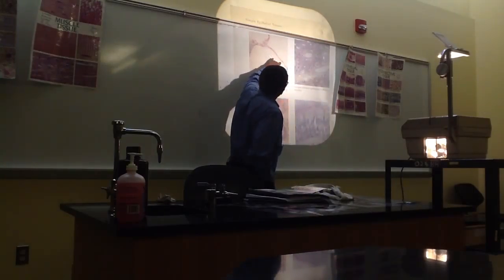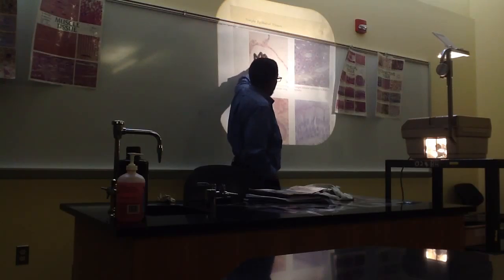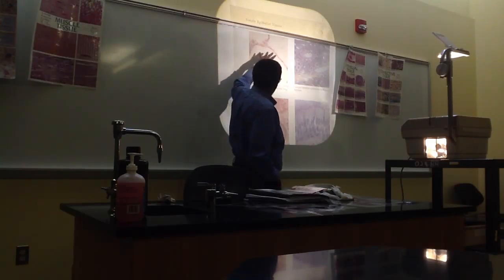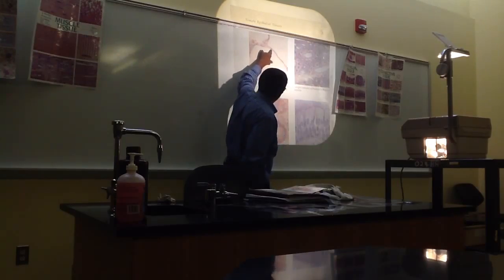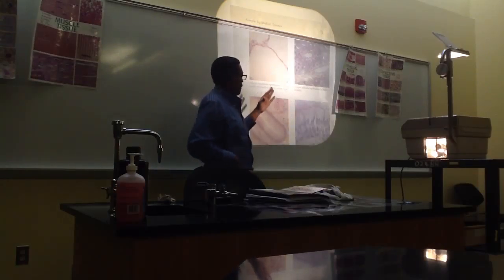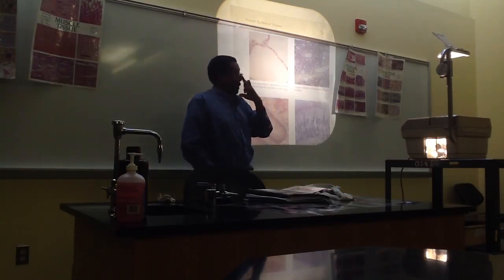Okay. Now, the shape of the nuclei look like, this is a tissue, it takes up stain. All right, this is not stained, so this is free space. So, how many layers do we have between the free space? You don't even see a basement membrane. Wow. All right, so this is just one layer. So this would be simple epithelium. And if you look at the shape of the nuclei, they look like they've been flattened. Squamous. All right, so that would be simple squamous. It would not be one of the tissues that you would have to identify.